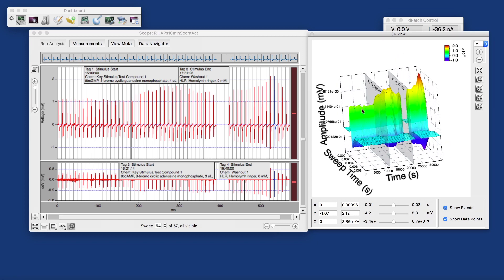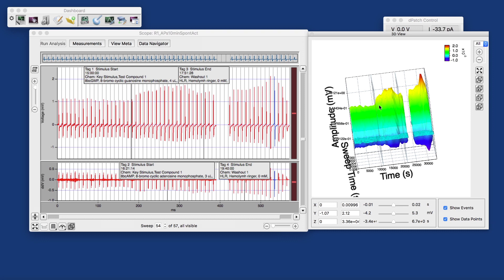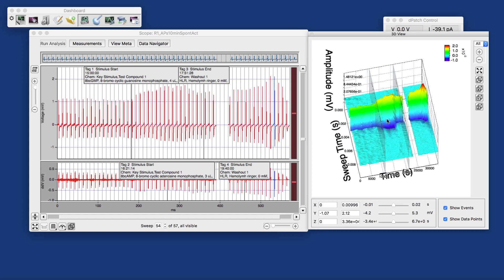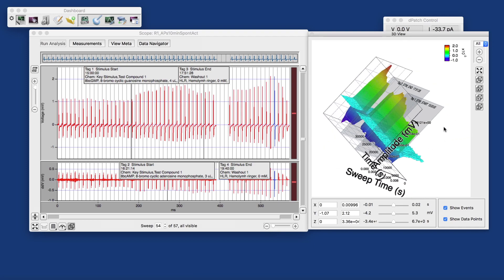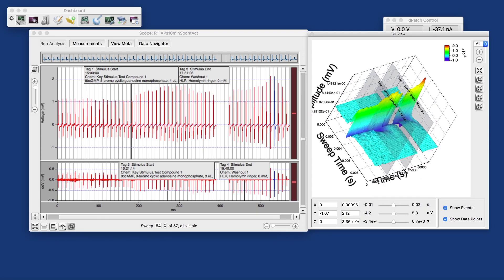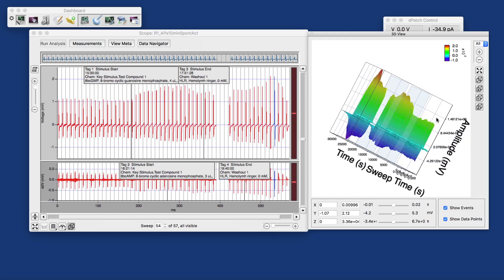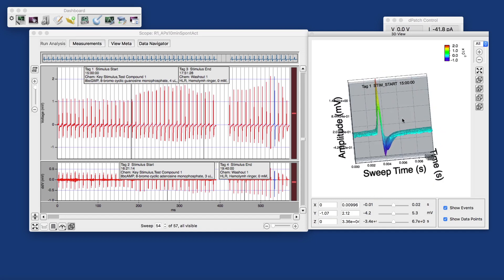What's not easy to see without changing the angle of view is that the repolarizing phase becomes a little longer. Based on this dataset — which is actually almost 20 years old now — we postulated that the drug we applied affects two different types of ion channels: nonspecific cation channels that affect the peak-to-peak amplitude of those extracellularly recorded action potentials, and delayed-rectifier potassium channels that affect the repolarizing phase. That has since been shown to be the case in patch-clamp recordings from isolated cells of this type — isolated olfactory receptor neurons. The value of this three-dimensional display is also in assay development, to find out what parameters to analyze in order to quantify the changes being observed.